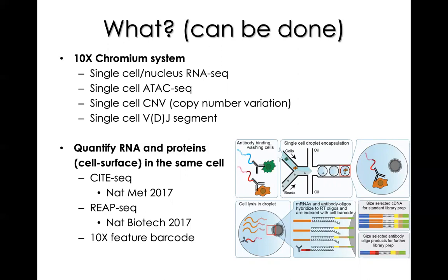I also encourage people to take a look at future assay development. There has been a lot of development in recent years. For example, 10x just announced that by the end of the year, they will start to support a protocol to do single cell RNA sequencing and ATAC-seq from the same cells. That will be a very important application for many groups.